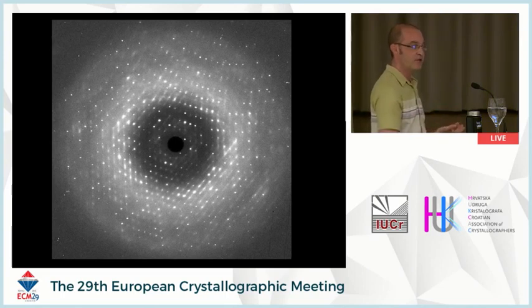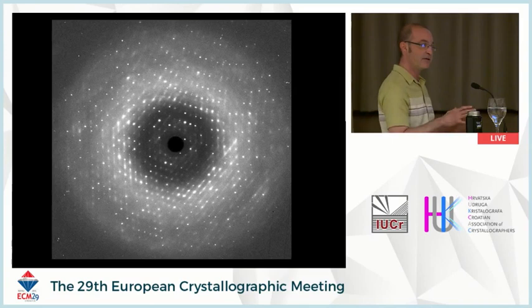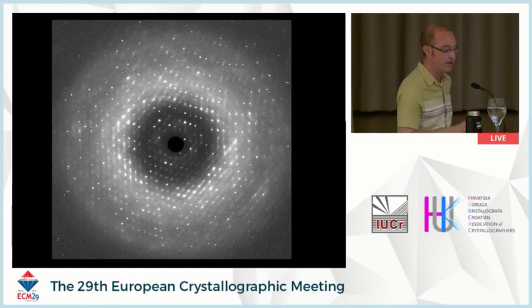This is related to the variational scattering that was already mentioned in Lois's talk. In addition, we have streaked features, which protein crystal diffraction patterns often have. And this is related to thermal diffuse scattering or vibrations or maybe other types of disorder in the protein crystal. And then finally, there are these cloudy features as well that you can detect, which may be on length scales in reciprocal space that are several Bragg peaks, or at least larger than the distance between the Bragg peaks, but yet smaller scale than this ring. And so that's also related to the variational scattering.